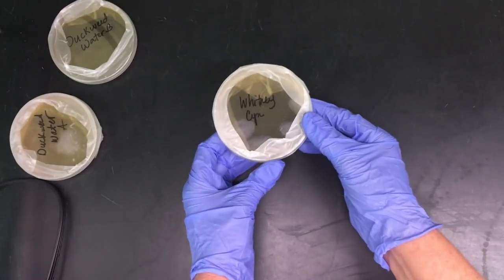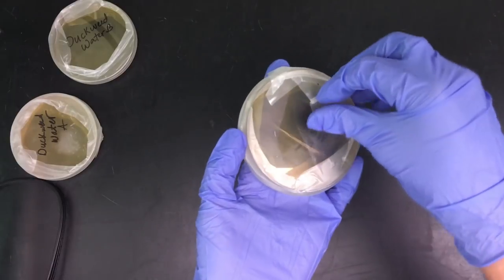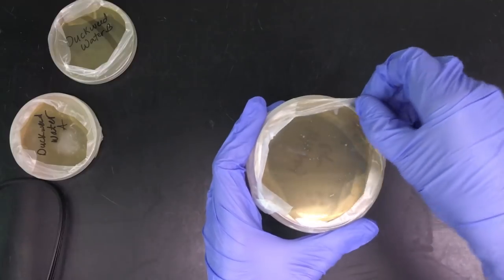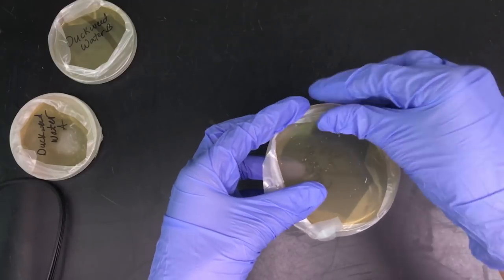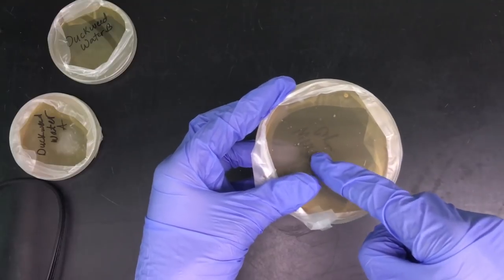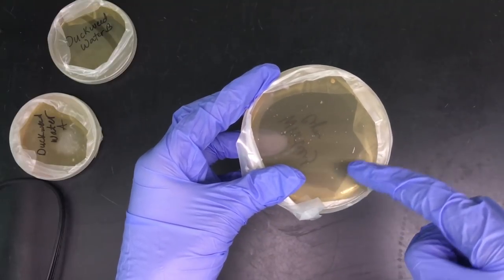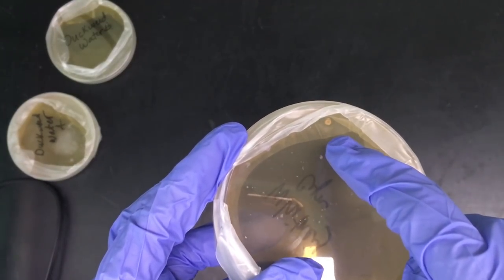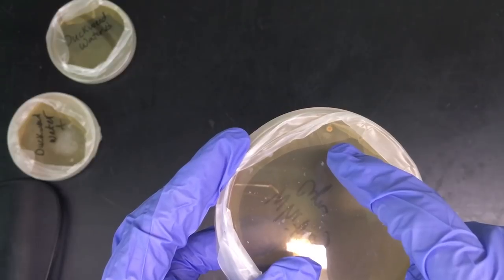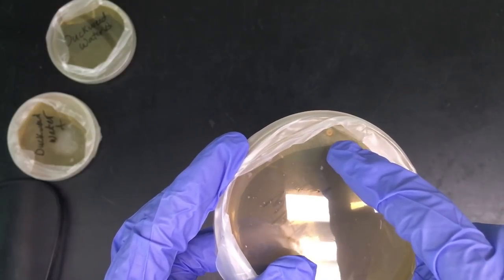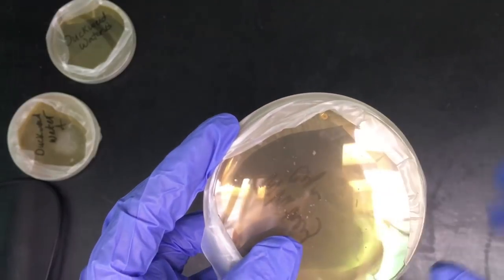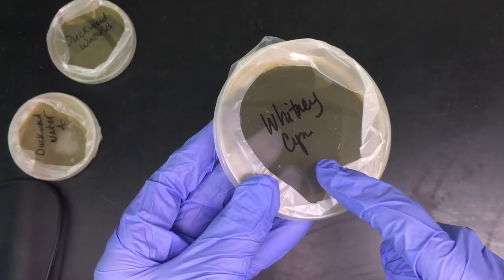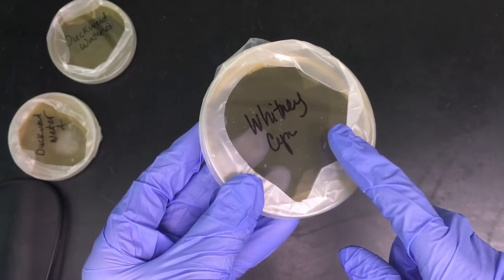Okay and then this is Whitney Canyon, so a hiking trail in Santa Clarita. And it looks like we do have a few colonies in here. Some of these are specks from the agar, the agar had clumped together, and these specks are just clumped agar. But over here this colony right there is definitely a very good coliform bacteria colony. It has a nice light pink color so this is positive for one. So this is one of the reasons why when you're hiking that you don't drink any creek water or stream or lake water without purifying it, running it through a filter or adding iodine drops or two to your water bottle or boiling it.